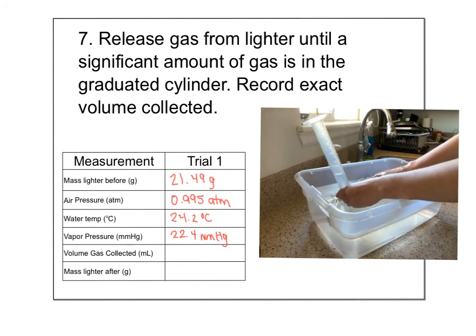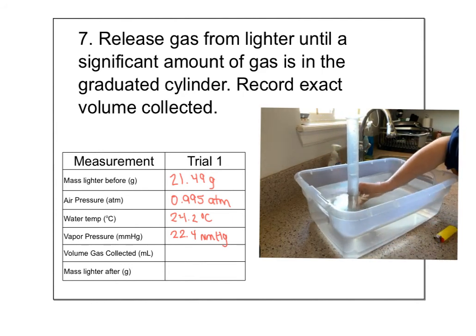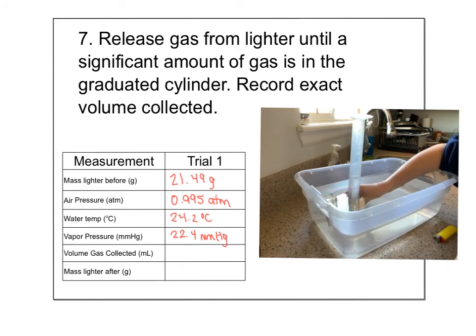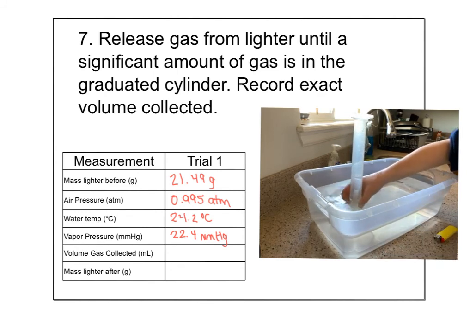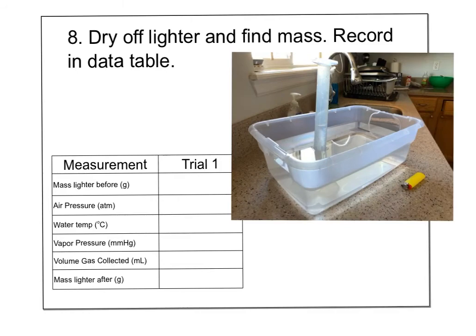Almost done. Taking out the lighter and reading the graduated cylinder — it's inverted so we're reading it backwards — I can see about 55 to 57 milliliters collected. I'll record that as 57.0 mL.